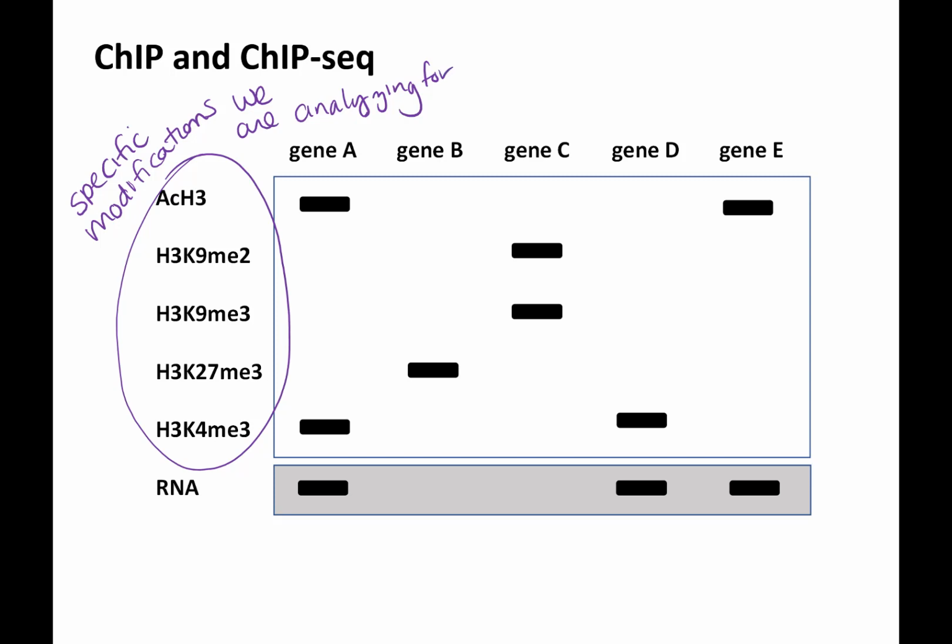You have an antibody to each one of these individually. Your band is saying, yes, DNA was associated with the specific modification.